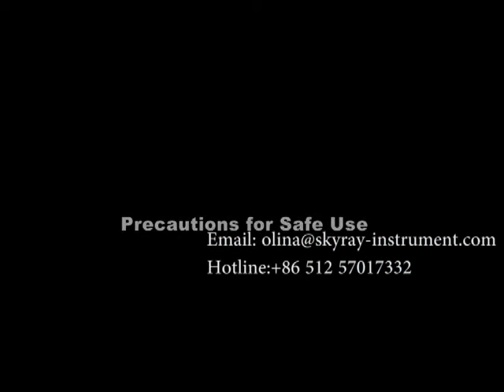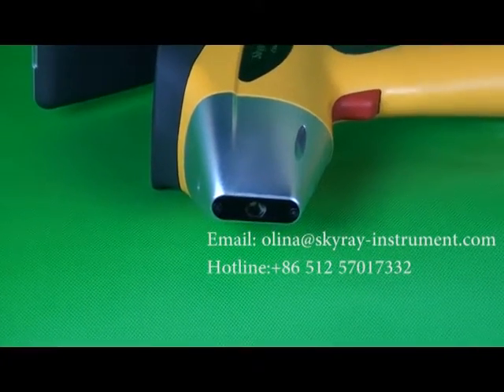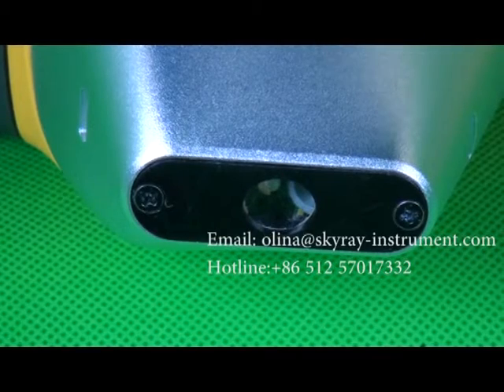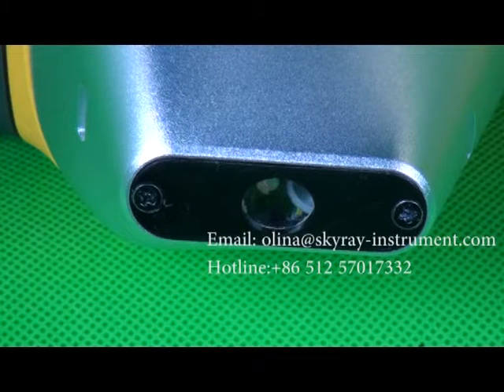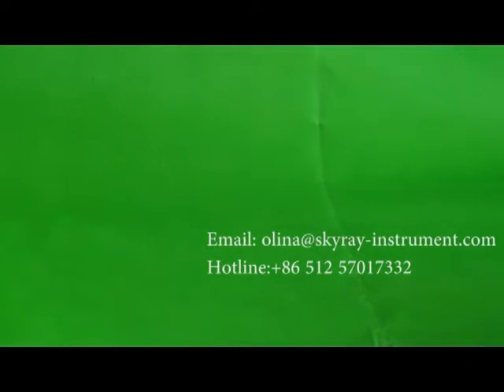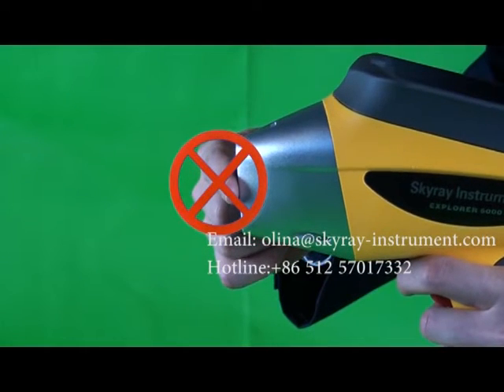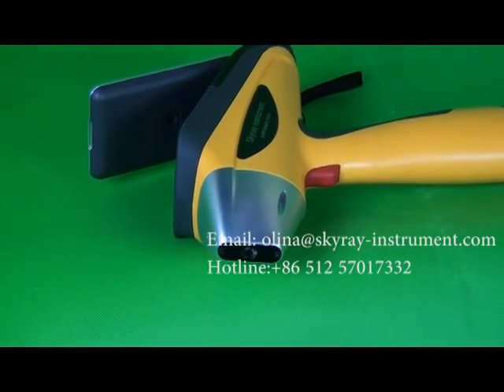Precautions for safe use. First, regarding the protection of the beryllium window of the detector: once the beryllium window is broken due to external force, the device may not function normally. Therefore, handle the detector lightly, do not touch the window film with fingers or fingertips, and keep the window film away from any sharp or cutting-edge objects to prevent scratches or breakage that could damage the beryllium window.